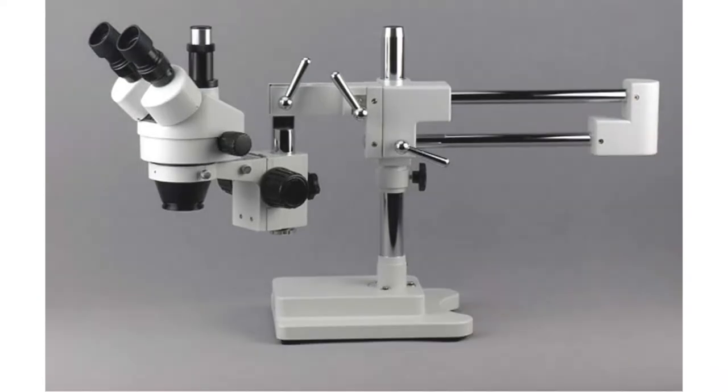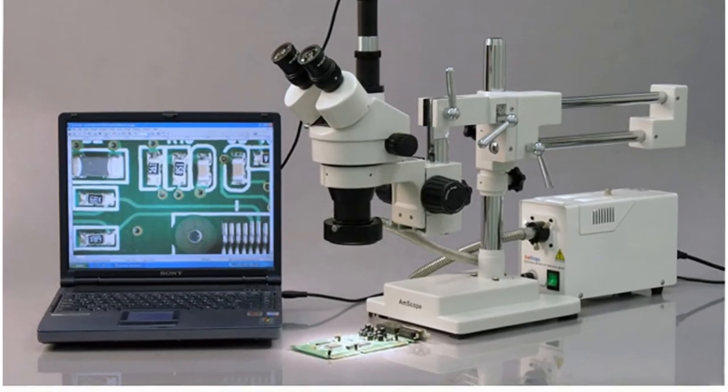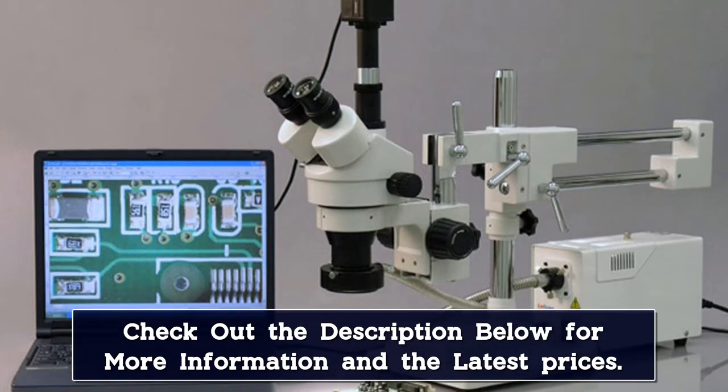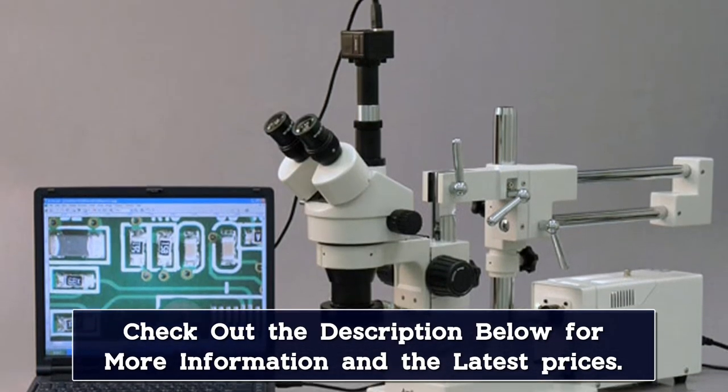This option allows you to take photos and record videos of your subjects or project what you see onto a screen. So when using your microscope for teaching or posterity, a trinocular model is ideal.